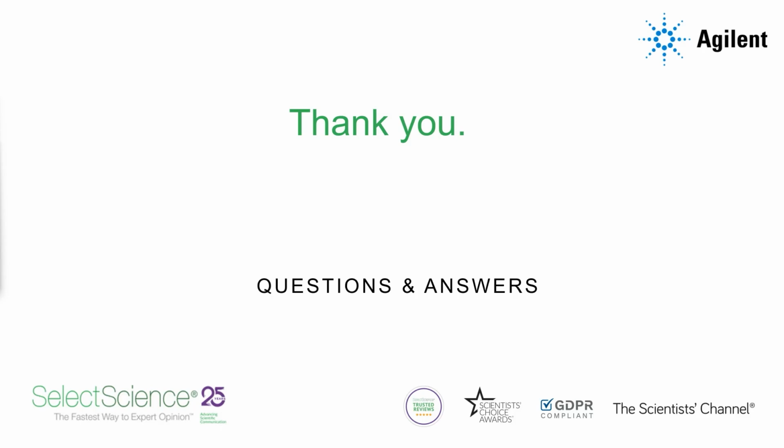Thank you. And then another one here asking whether this technology is only good for functional assays or whether it provides any benefits for simple surface staining characterization of cell markers. You can use it for single cell surface staining characterization as well. We focus on functional assays just because this is where our expertise lies, and what we try to bring app notes about, but you can use it for other applications as well.